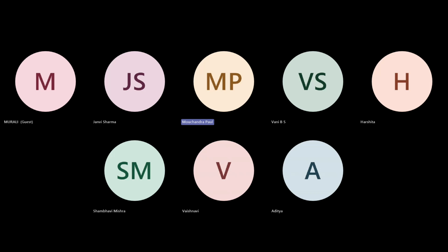So two techniques are possible. You can do it through a direct method, which is non-destructive in nature, or you can do it through an indirect method, where you have to lyse the cells, that is destructive in nature. In general, people use the first one, the direct method, and for that people use two types of machines. One is called a hemocytometer, another is called a Coulter counter.